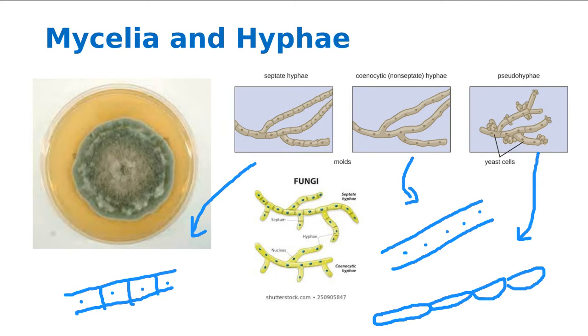And on those, you will have budding yeast, and that's the giveaway. So it appears that maybe I updated this just recently and I didn't put the updated version on Blackboard. I will do that right after we get out of class today. Okay. So everybody see the difference? Anybody have any questions?